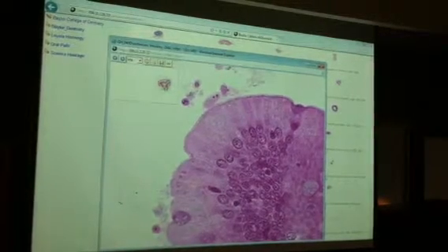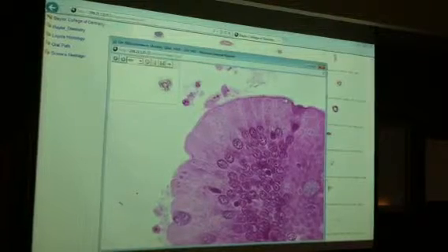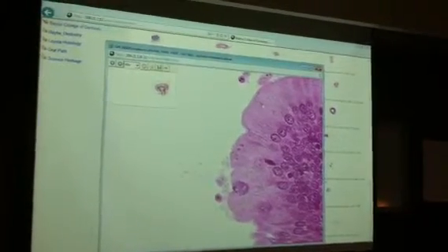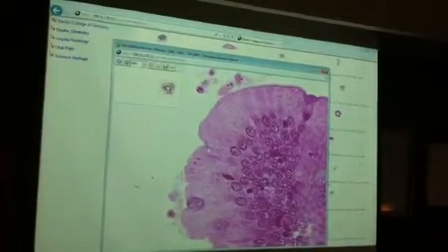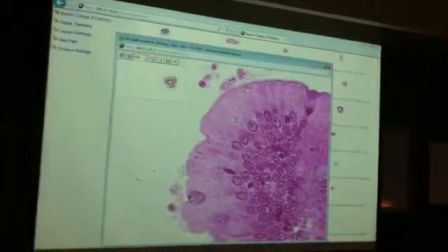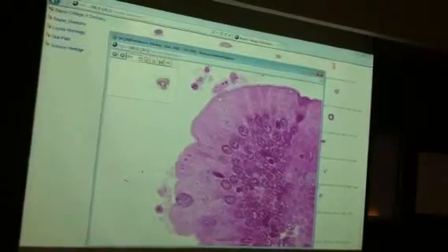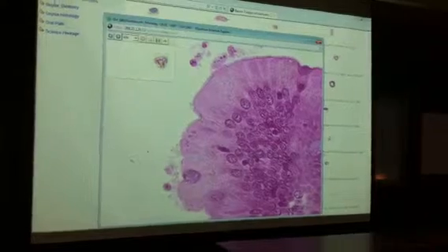So wow, you can almost see individual microvilli there. That's going to just blow my theory apart for you guys. Just ignore that. If you look over here, you definitely can't tell. I'm at 40x. You won't see. But anyway, you see this dark red line going across here. What really is something else. All this fuzzy stuff up here at the top of the epithelium is your brush border.